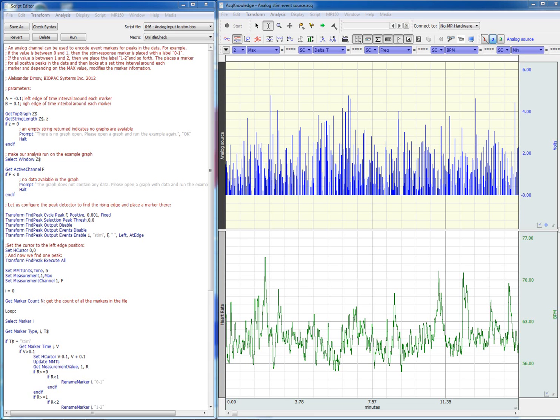Using this script, we can convert analog pulses into markers, and then different labels can be assigned depending on the amplitude of the pulse on the analog channel. A similar capability already exists in the software, but it only applies to digital channels.